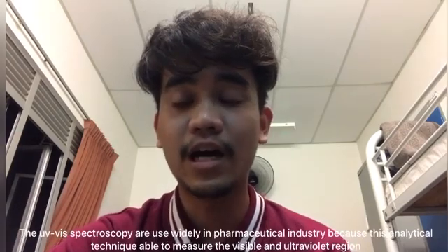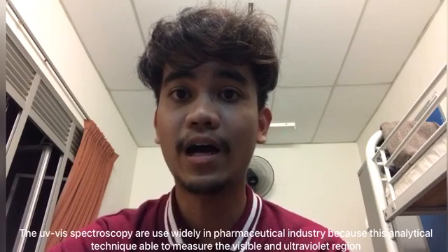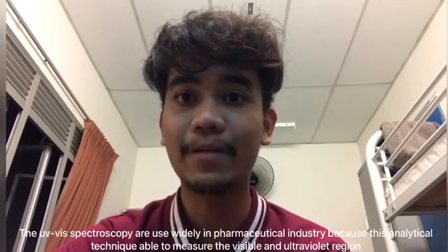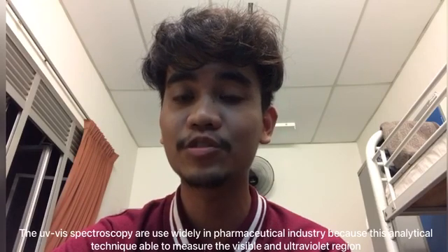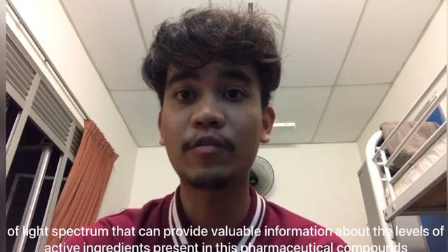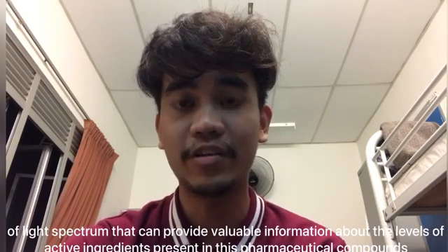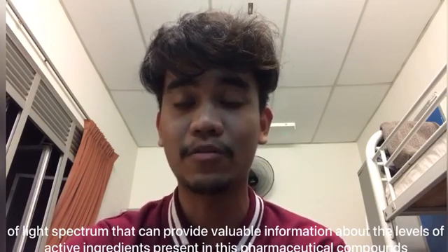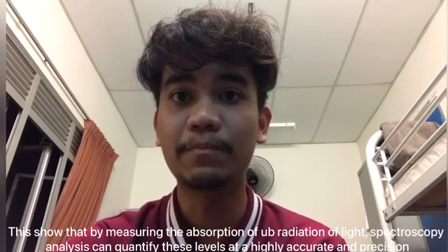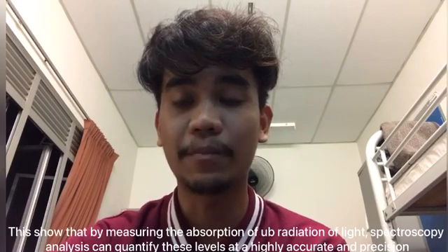wavelength. Ultraviolet spectroscopy is used widely in the pharmaceutical industry because this analytical technique is able to measure the visible and ultraviolet region of the light spectrum that can provide valuable information about the level of active ingredient present in the pharmaceutical compound. Also, this analytical technique is good for detecting impurities of pharmaceutical compounds.